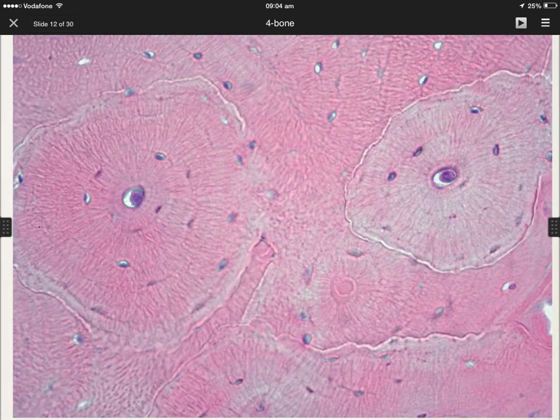You may be asked here about the light microscope feature of the osteocyte. It is oval and basophilic in staining. Nothing else can be seen in the light microscope picture in this slide. This circle is called the Haversian system, this area is called interstitial lamellae, and the area in between the osteocytes is called concentric bony lamellae.